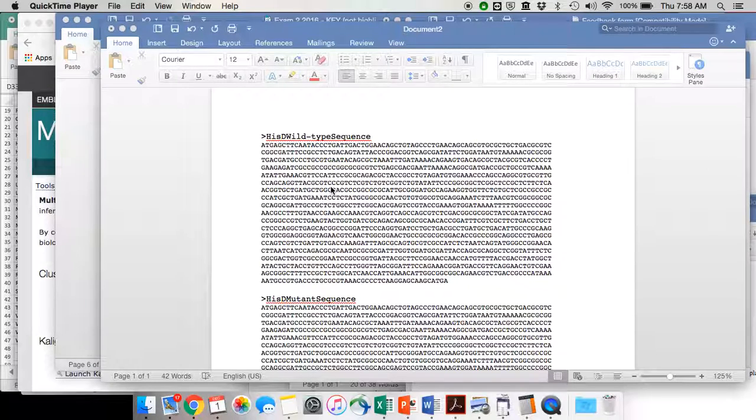So I'm recording this because we had some issues on Tuesday with doing the nucleotide sequence alignment with DNA Subway. It looks like some of their settings have changed, so there is a way to do this, and I'm just going to walk you through it.